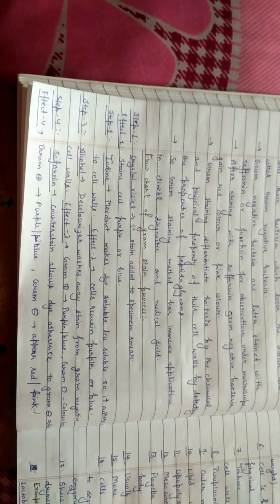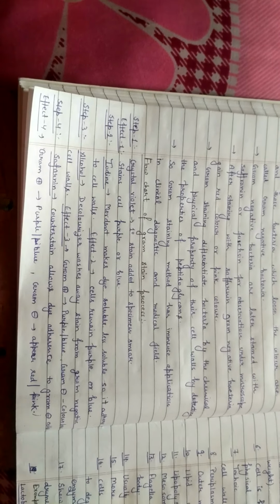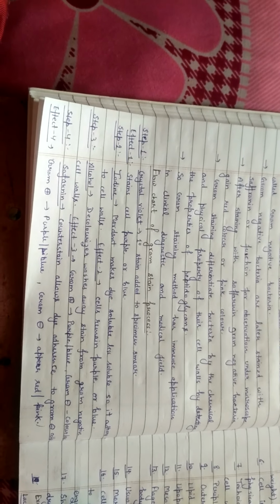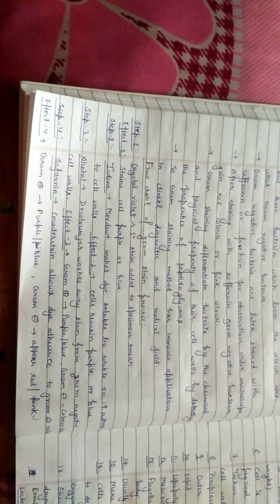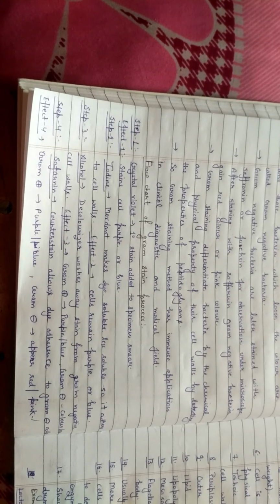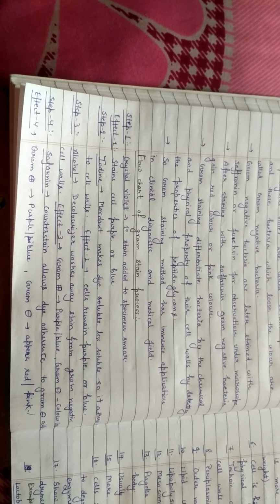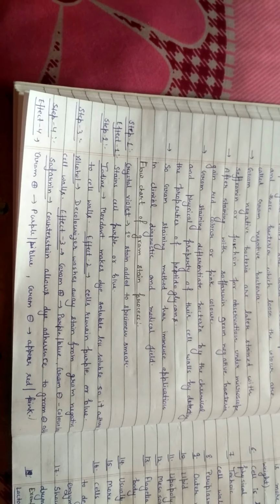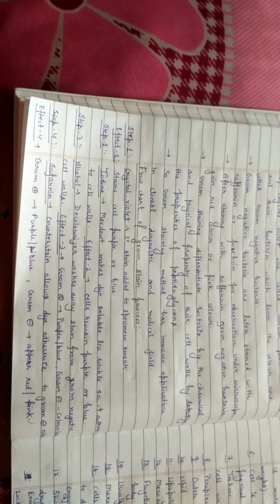After that, both bacterial species are treated with a counterstain, safranin. Because gram-positive bacteria are already purplish or bluish in color, they do not retain the safranin counterstain. But due to the absence of any color in gram-negative bacteria, they become reddish or pinkish in color after staining with safranin. So in the end, gram-positive bacteria remain purple or bluish in color, and gram-negative bacteria become red or pinkish in color due to the safranin.